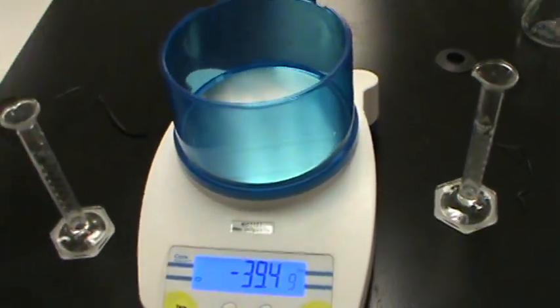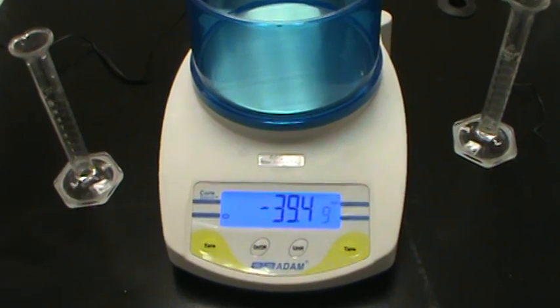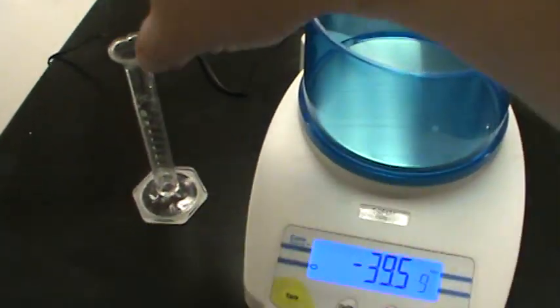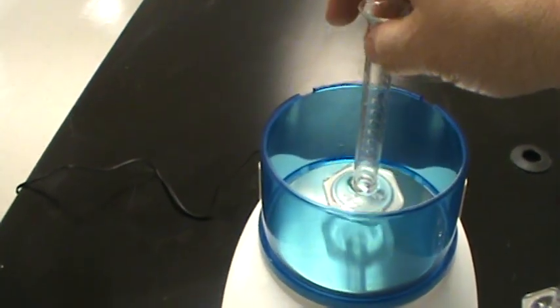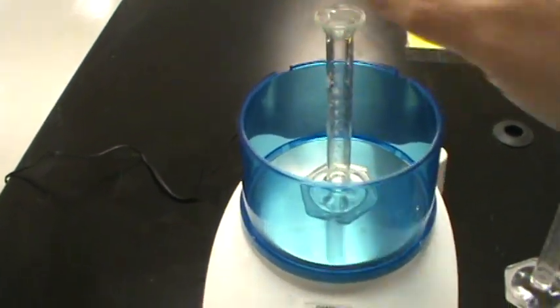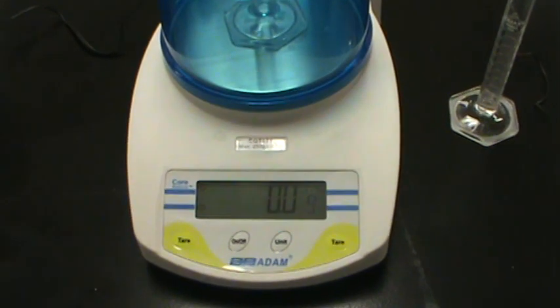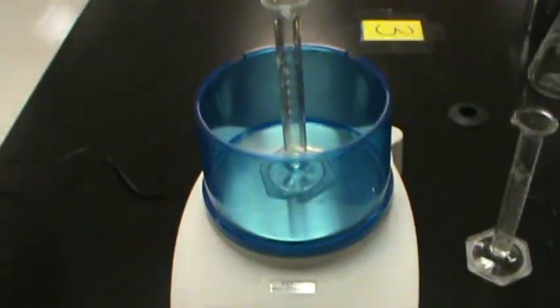Well, I was rooting around in the back room earlier and I found our digital scale. So I took an empty 10 milliliter graduated cylinder and zeroed it out so that when it sits there it says zero.